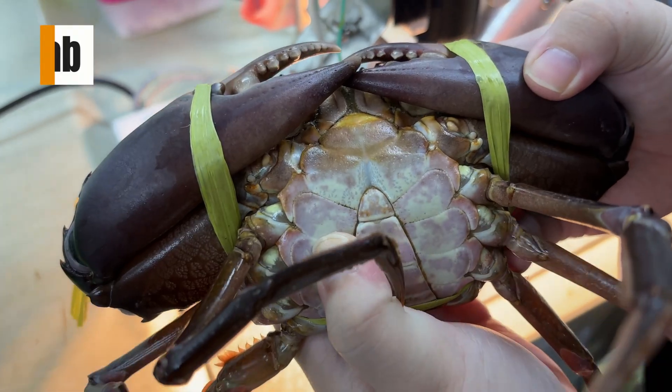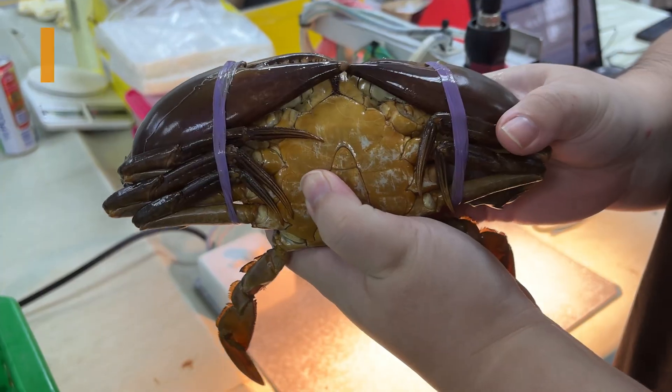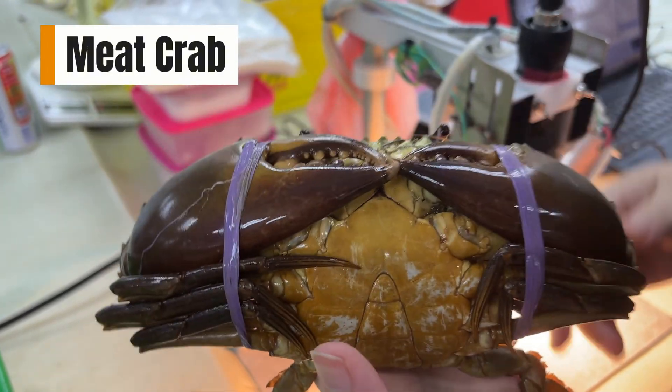A soft abdomen usually means the crab has more water and less meat — we call this a water crab. A firm abdomen, on the other hand, often indicates a meat crab with better flesh quality.